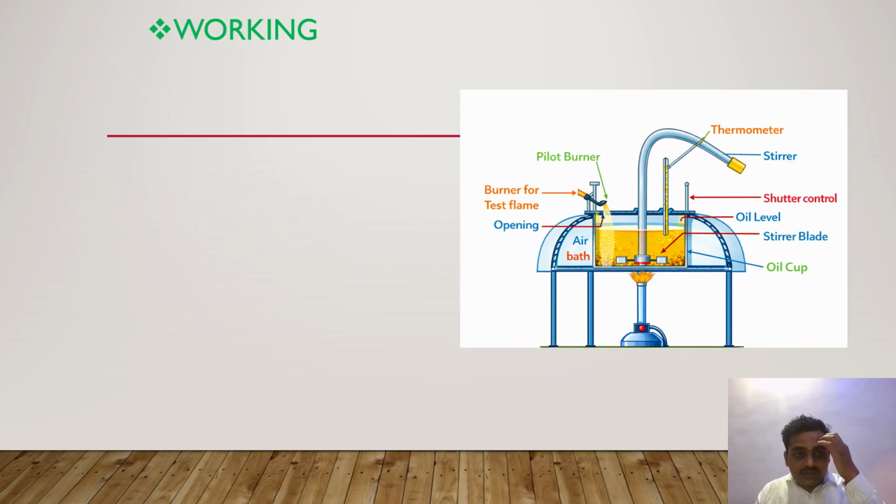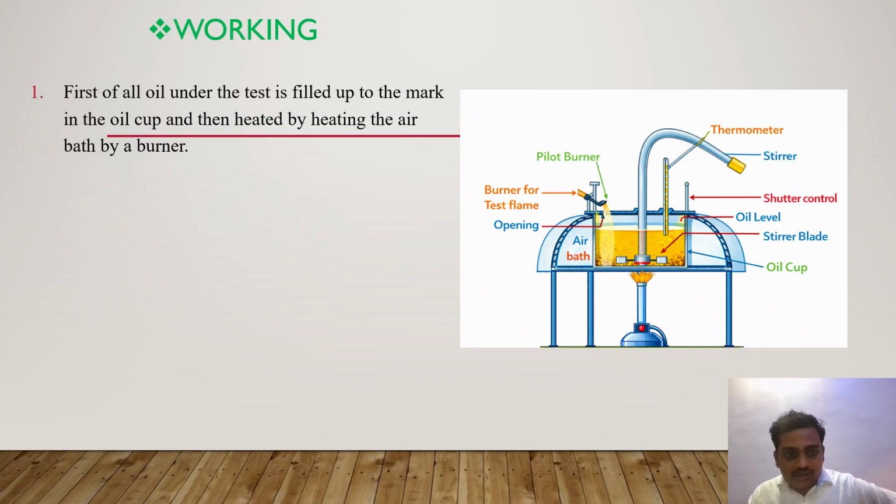So here is the working. First of all, the oil is filled in the oil cup up to the mark. Then we are heating the air.